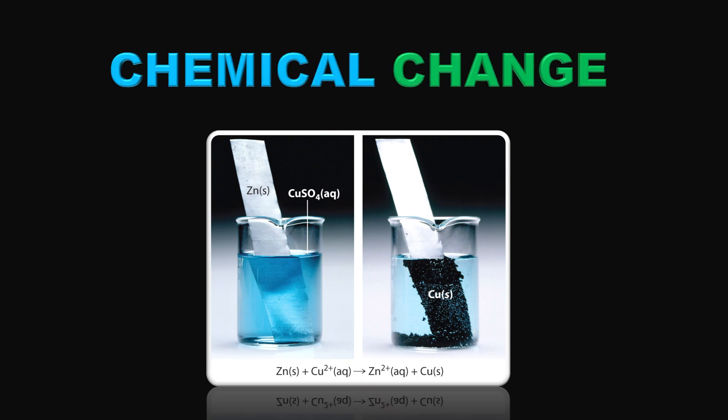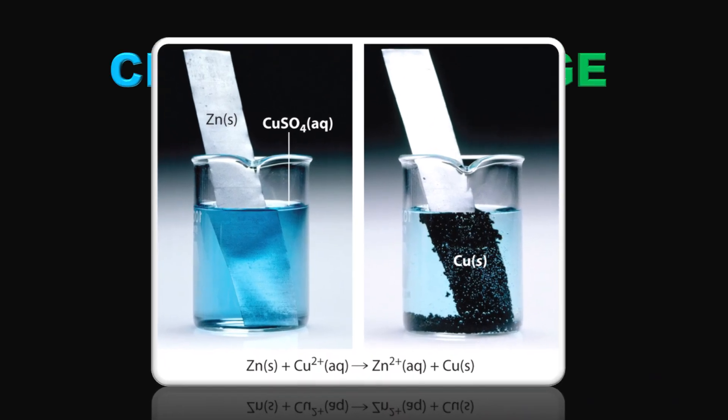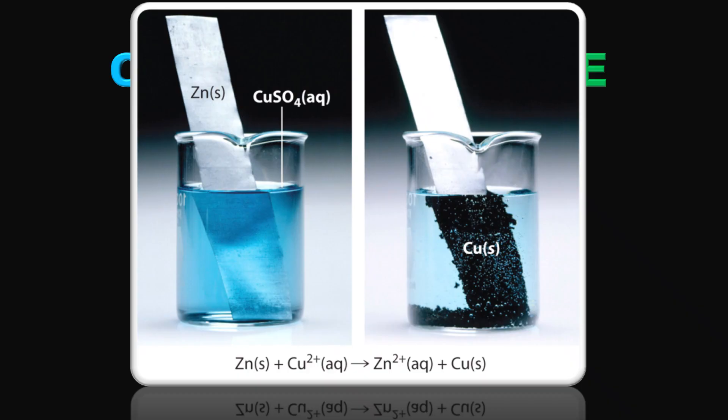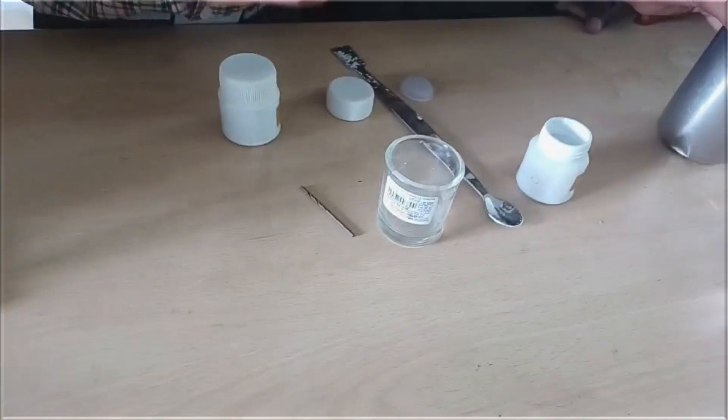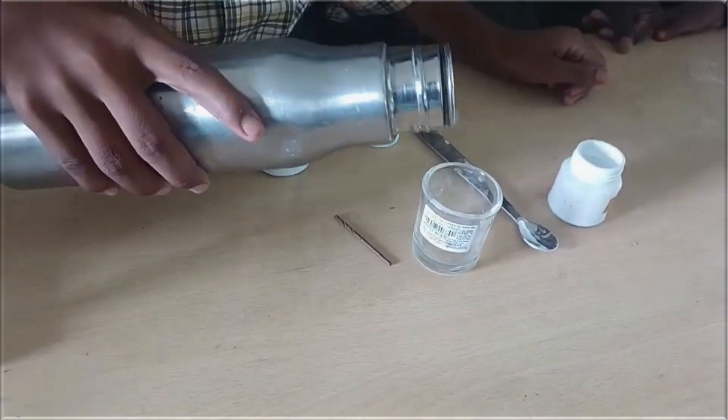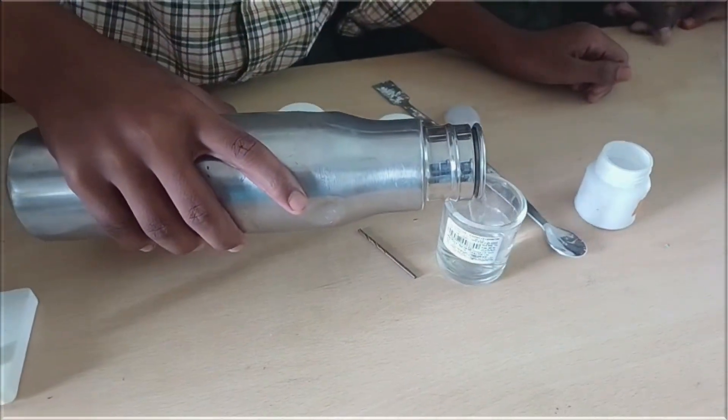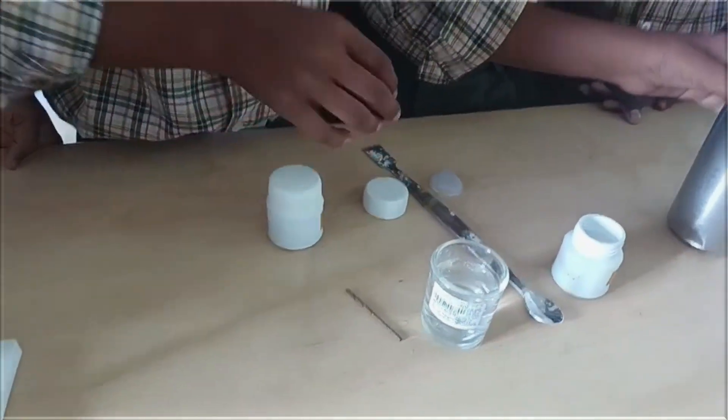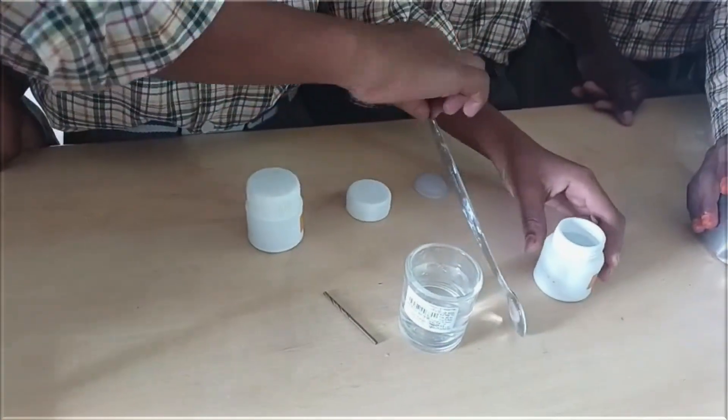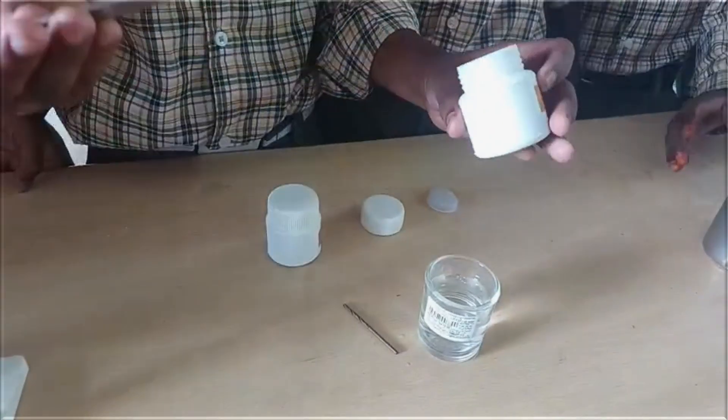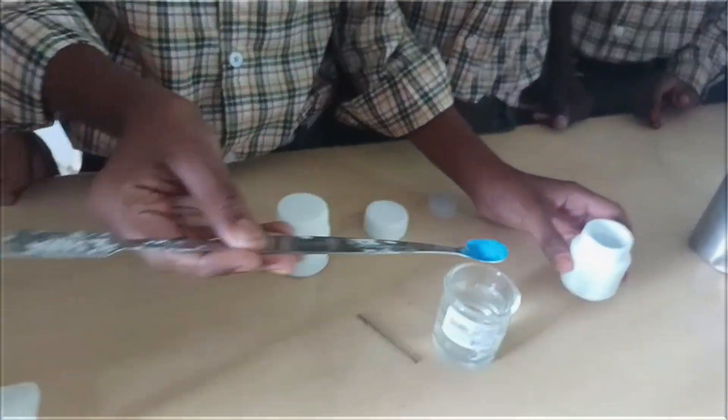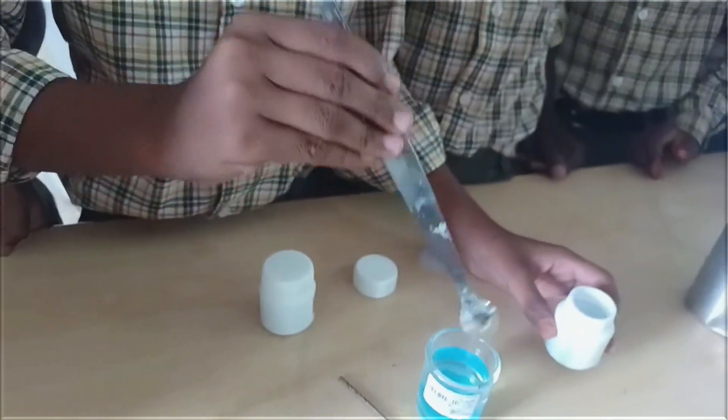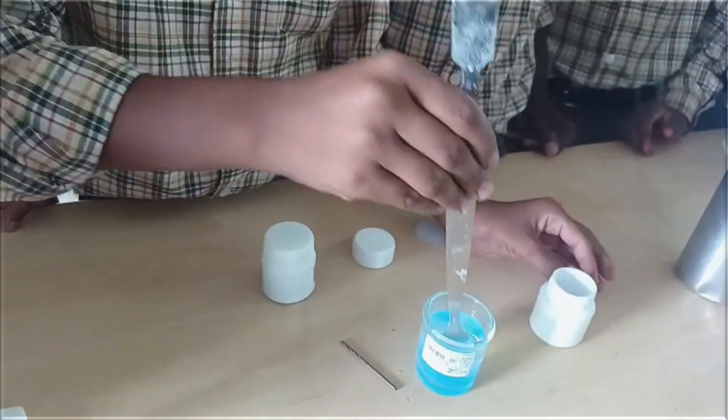Hi everyone, in this video we are going to learn about chemical change. They are our seventh class children. They are going to perform an activity by using copper sulfate. He dissolved about a teaspoonful of copper sulfate in a cup of water.